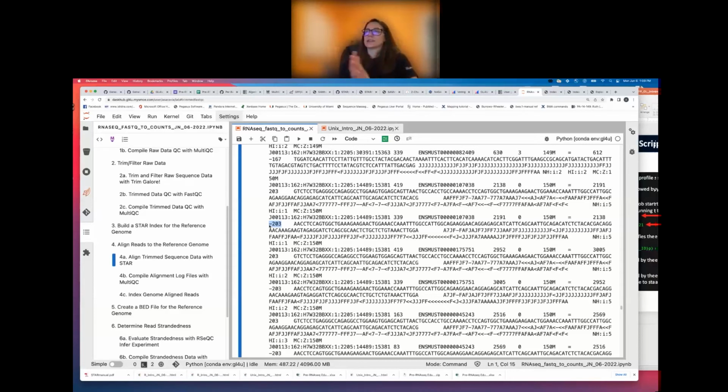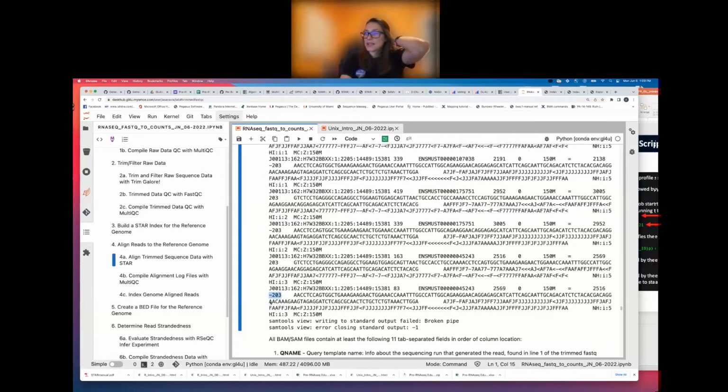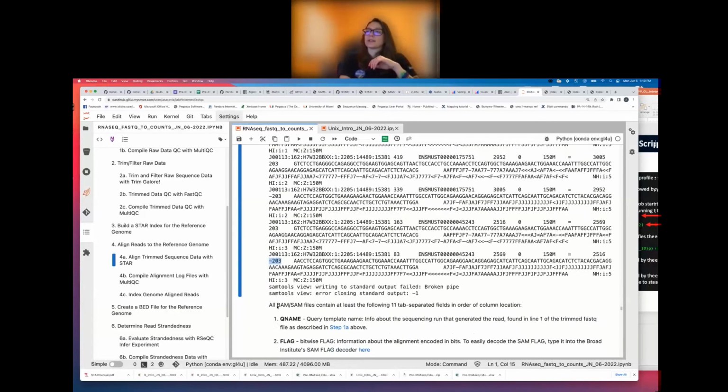So yeah, you could take either. Your mate pairs, with one being in the same direction and one in the opposite direction for each transcript it maps to, is fine. Or if you wanted to take it as a mate pair to transcript pair, then we have 5 transcripts represented, 2 reads, and so 1 read mapping to 2 transcripts, the forward read, and the reverse read mapping in the opposite orientation, and then the same with the other read, but to the 3 transcripts. Any questions about how to find out the orientation of the read relative to the transcript?